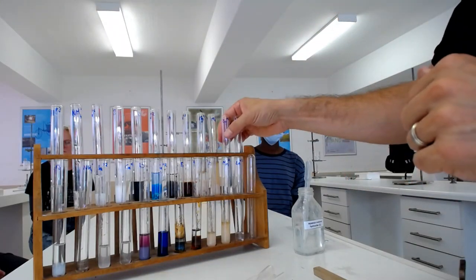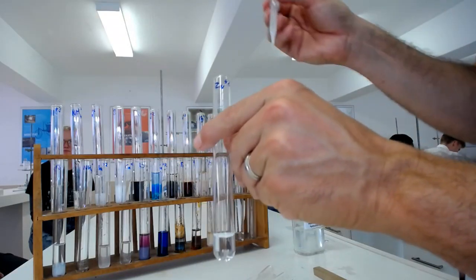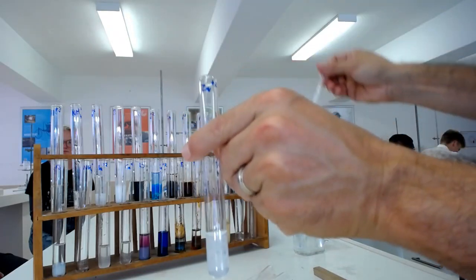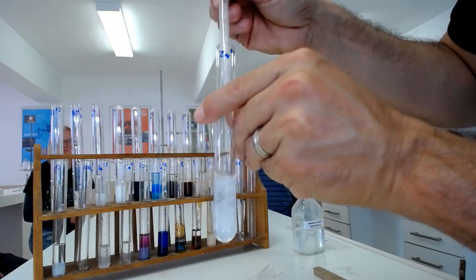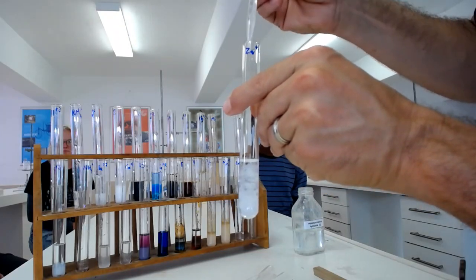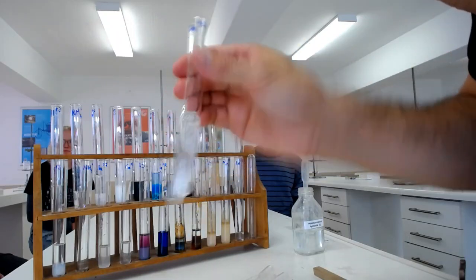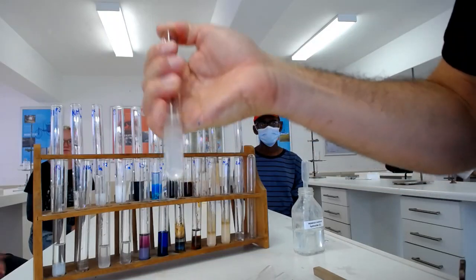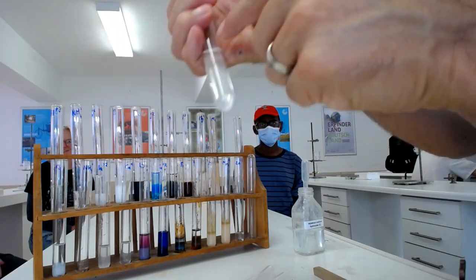Okay, what about zinc? White precipitate. Oh, do you see there's quite a few white precipitates? What's the difference? Is the white precipitate soluble or insoluble in excess? Soluble. With sodium hydroxide, does it become soluble? Let's see. So I'm adding quite a bit to it. Yes, it's becoming soluble. It's not very soluble. Okay, no it is. Sorry, there we go. It's totally soluble.